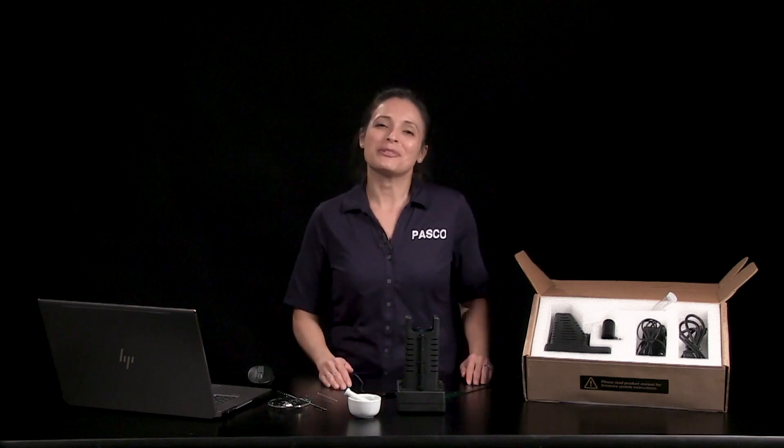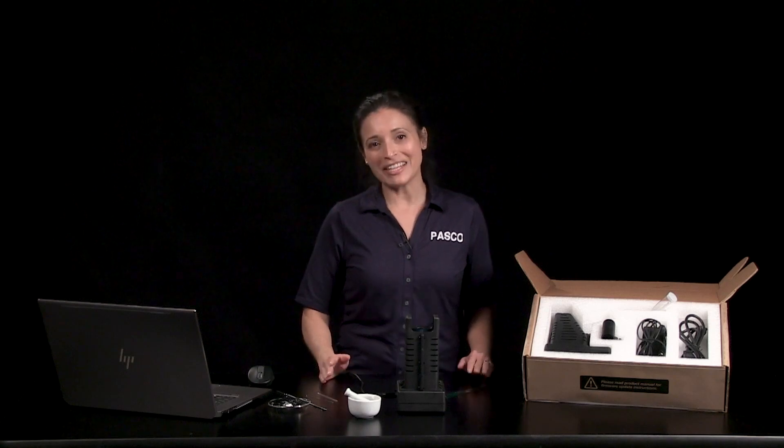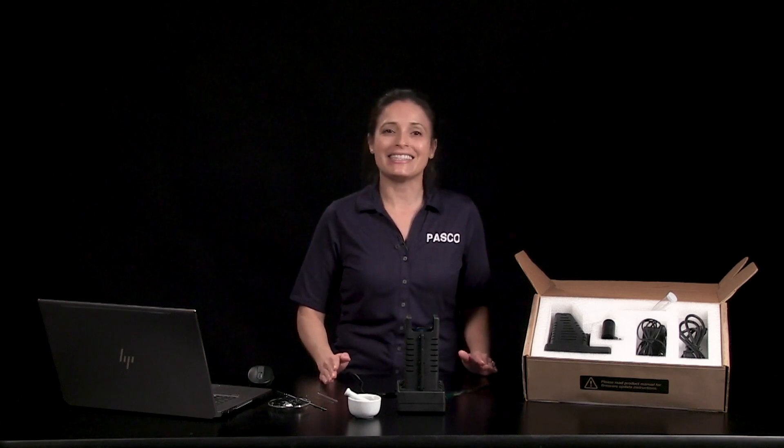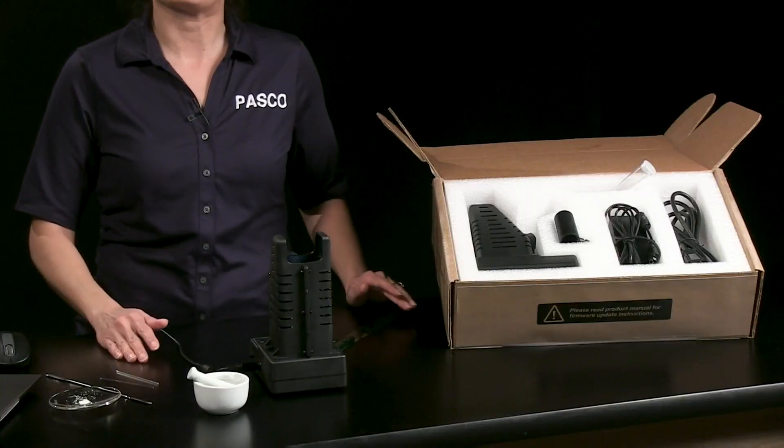Melting is an important property for determining the identity and purity of compounds. In this video, you'll learn how to quickly and easily determine a substance's melting point range with PASCO's wireless melting point apparatus.